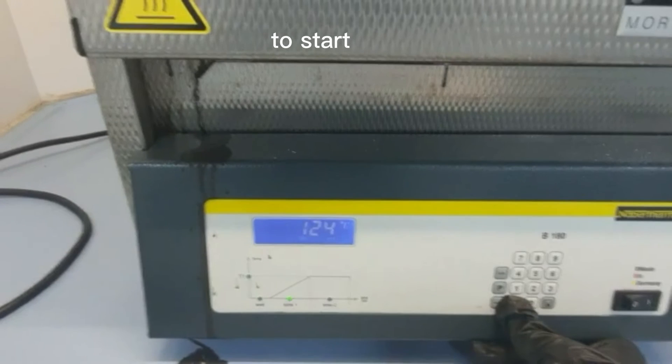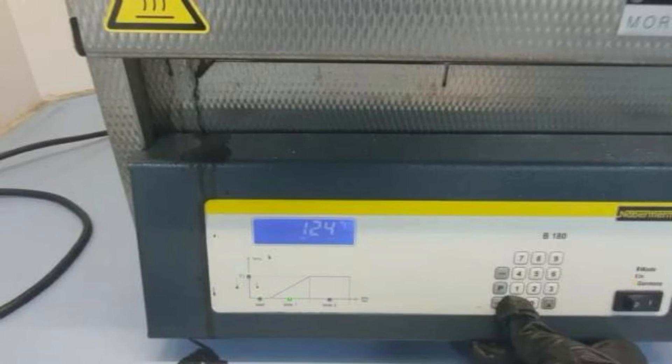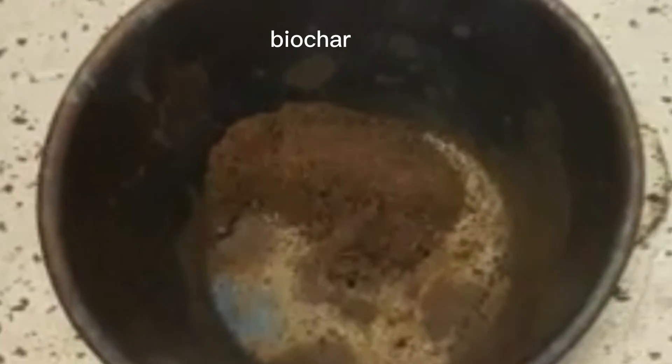Turn on the furnace to start the pyrolysis process. After pyrolysis, we will cool the stainless steel tubes at room temperature. This is the magnetic biochar we have produced.